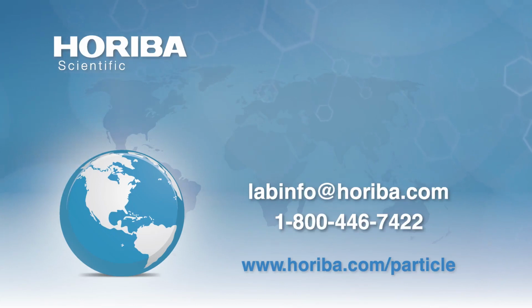So it's not a question of what's the best solvent. What is important, however, is that in non-aqueous systems, the presence of water in a solvent system or on the surface of the particle is what drives basically all the interfacial chemistry. And we tend to forget about this. Solvents basically do contain small amounts of water, parts per million.